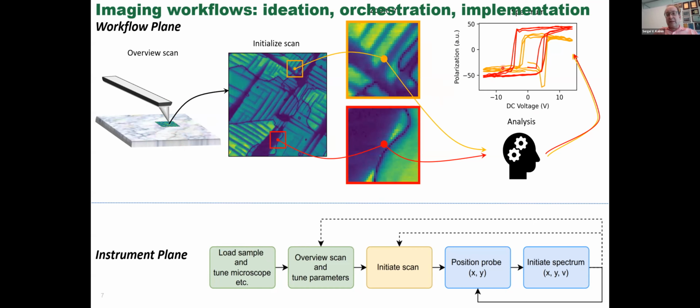After a while, I will select the region that I want to study in detail. And then I study it, and after the experiment, I will try to analyze the data. Again, the same question arises. Can I have a machine learning agent that will do the experiment planning, allow for the human in the loop intervention, and produce the data that is explainable? So what would it take to make it happen?